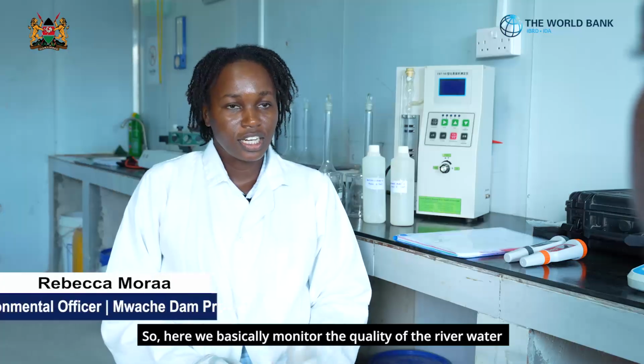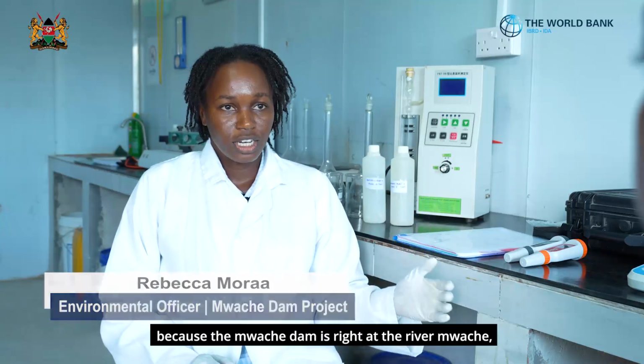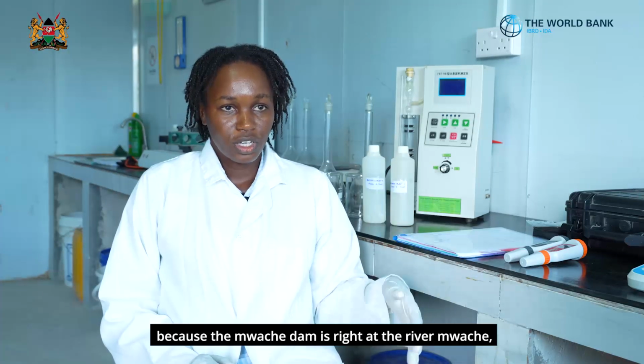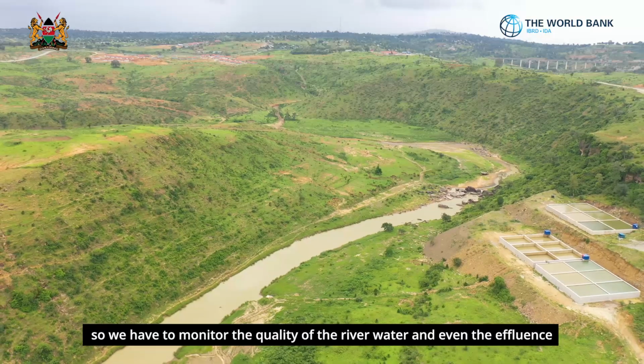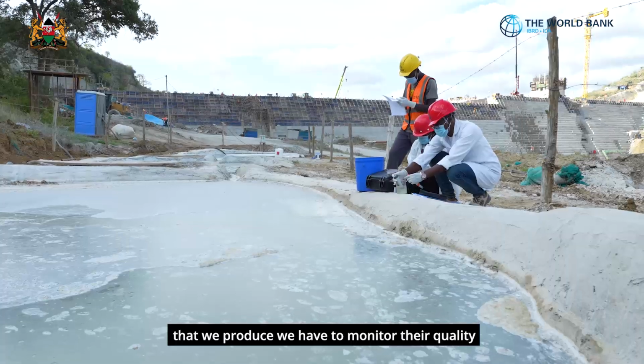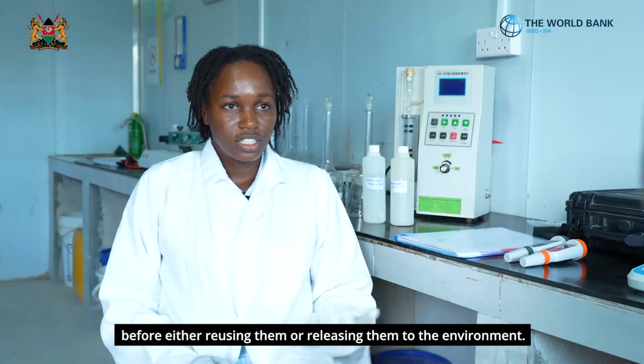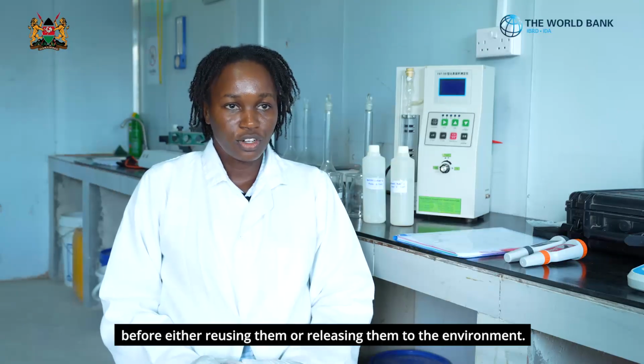So here we basically monitor the quality of the river water because the Mwache Dam is right at the river Mwache, so we have to monitor the quality of the river water, and even the effluents that we produce, we have to monitor their quality before either reusing them or releasing them to the environment.